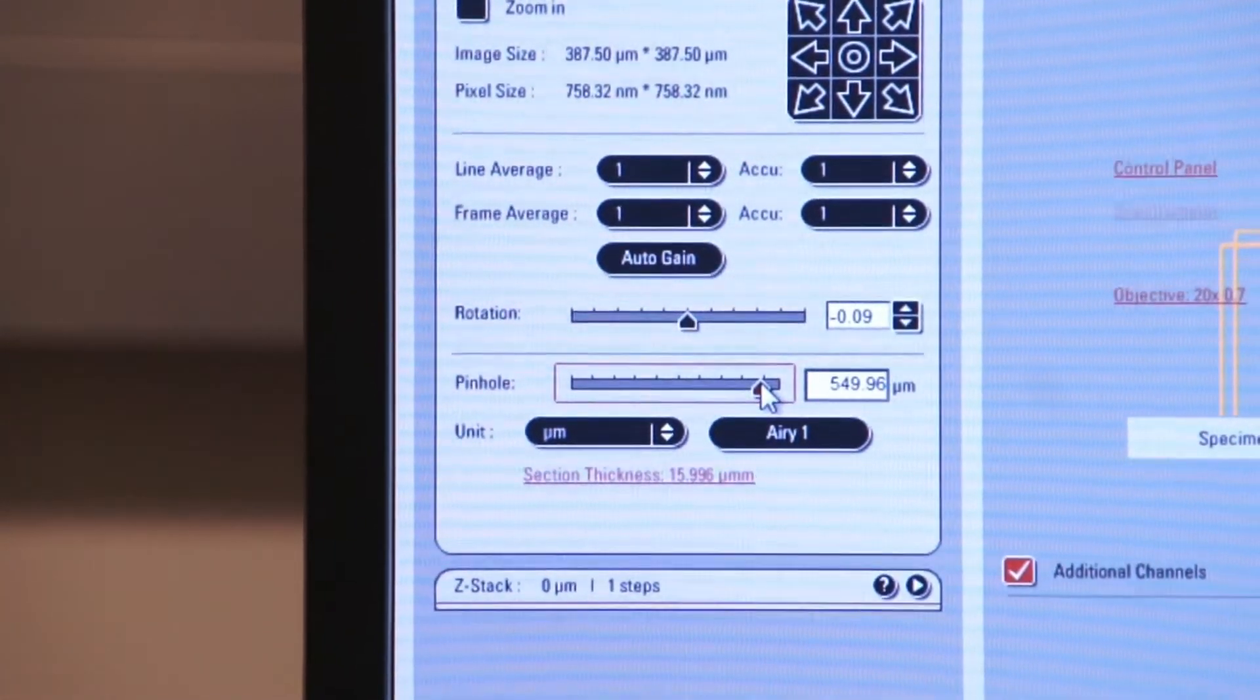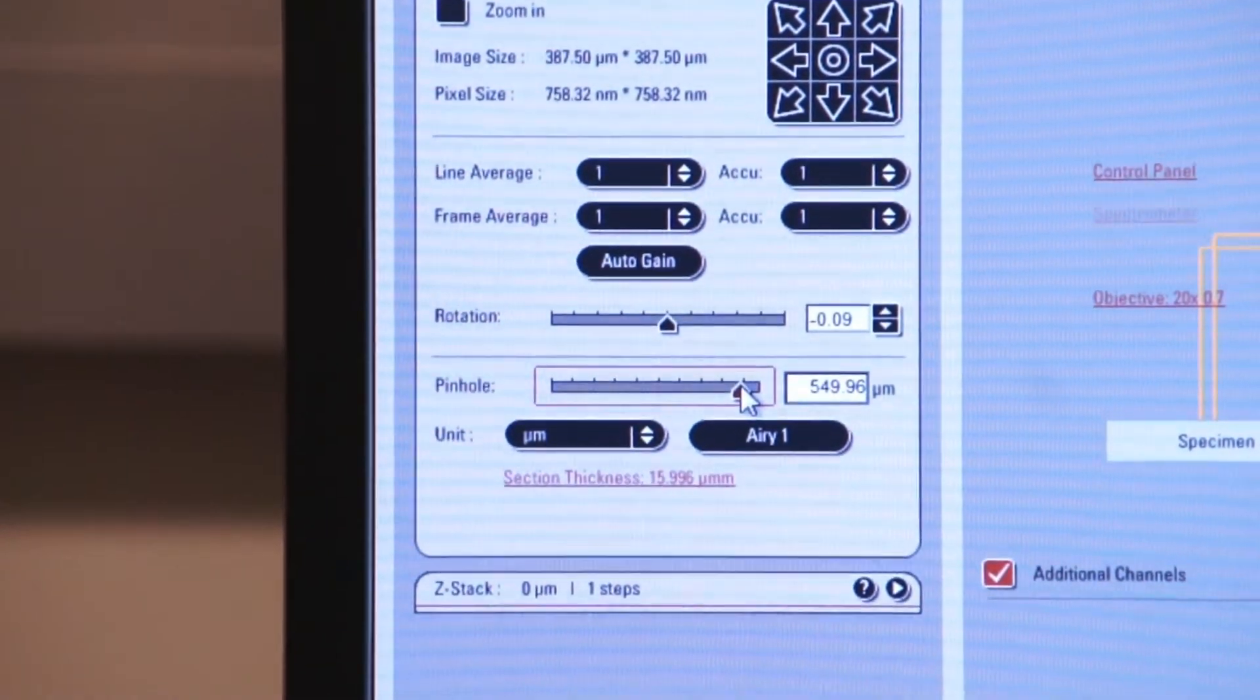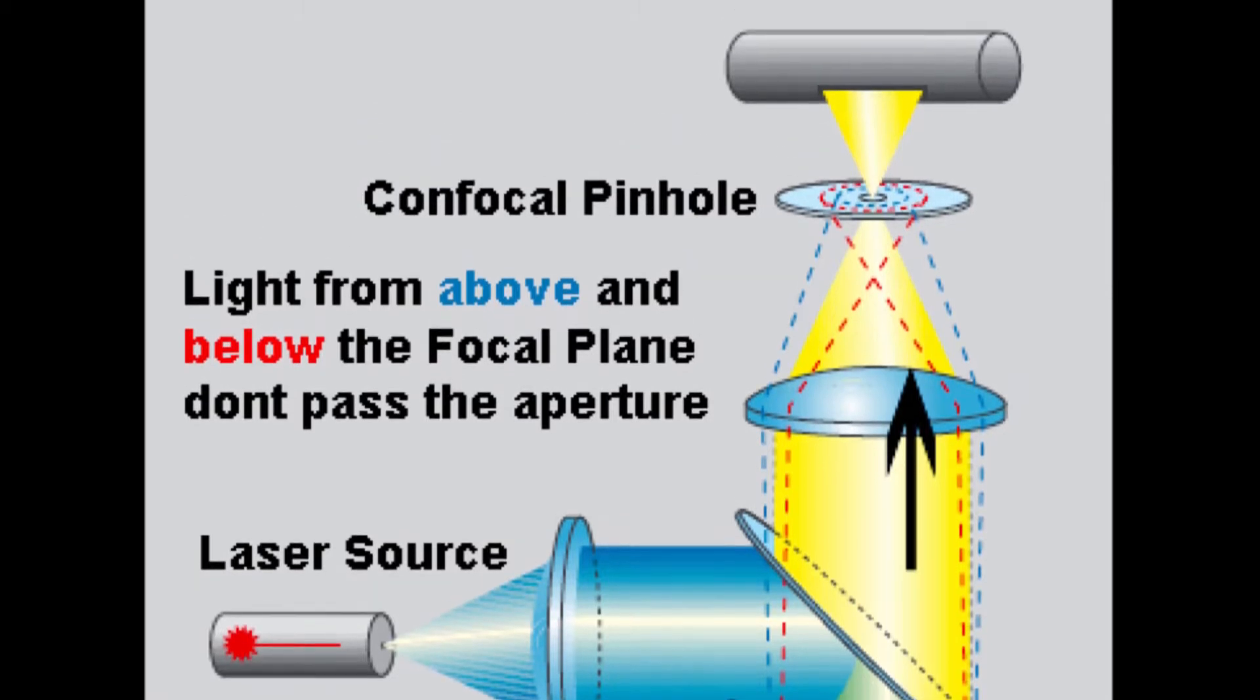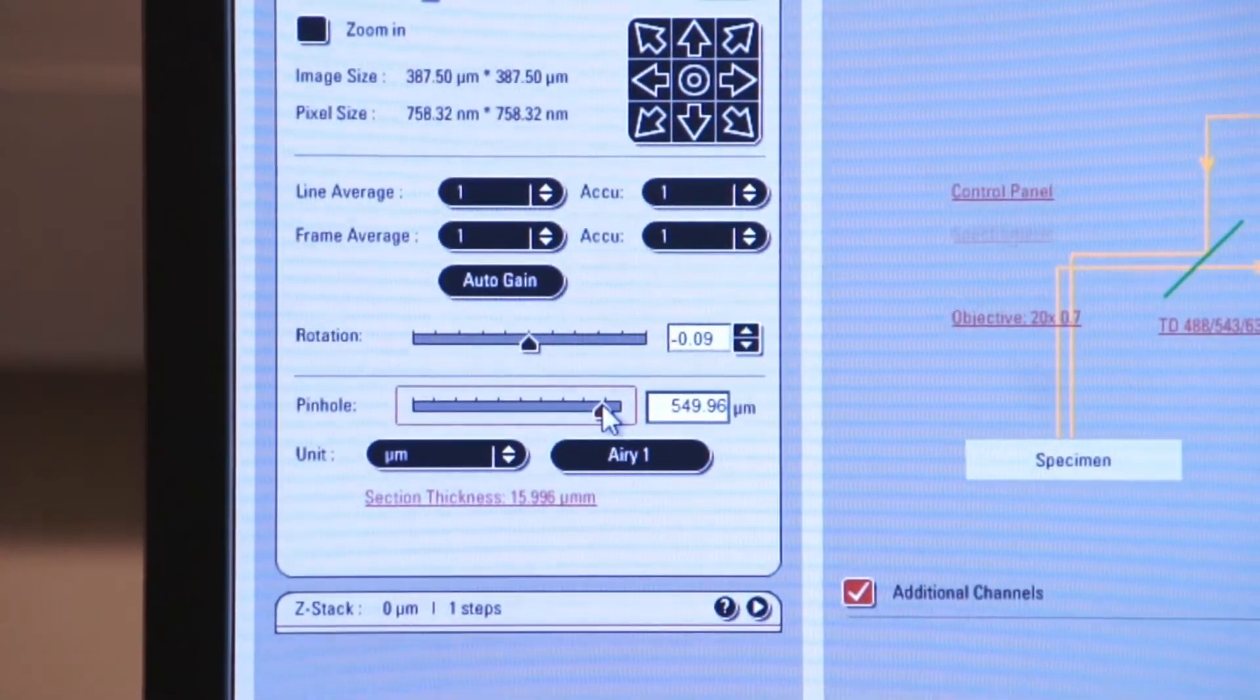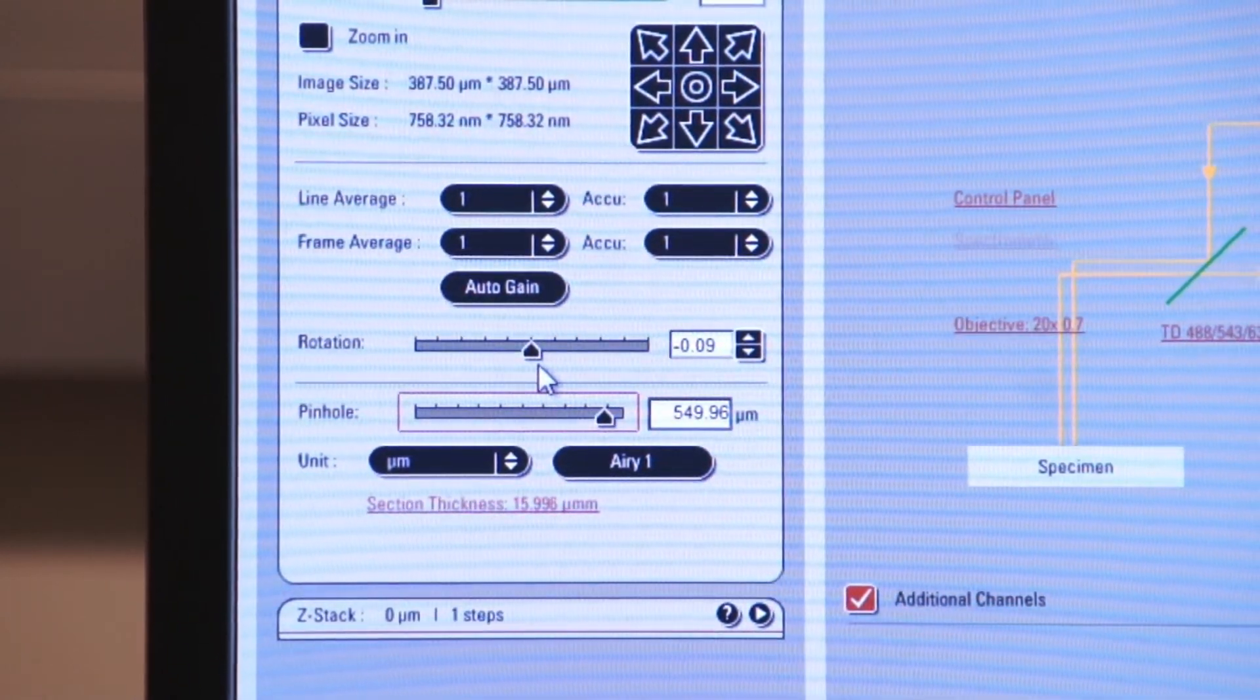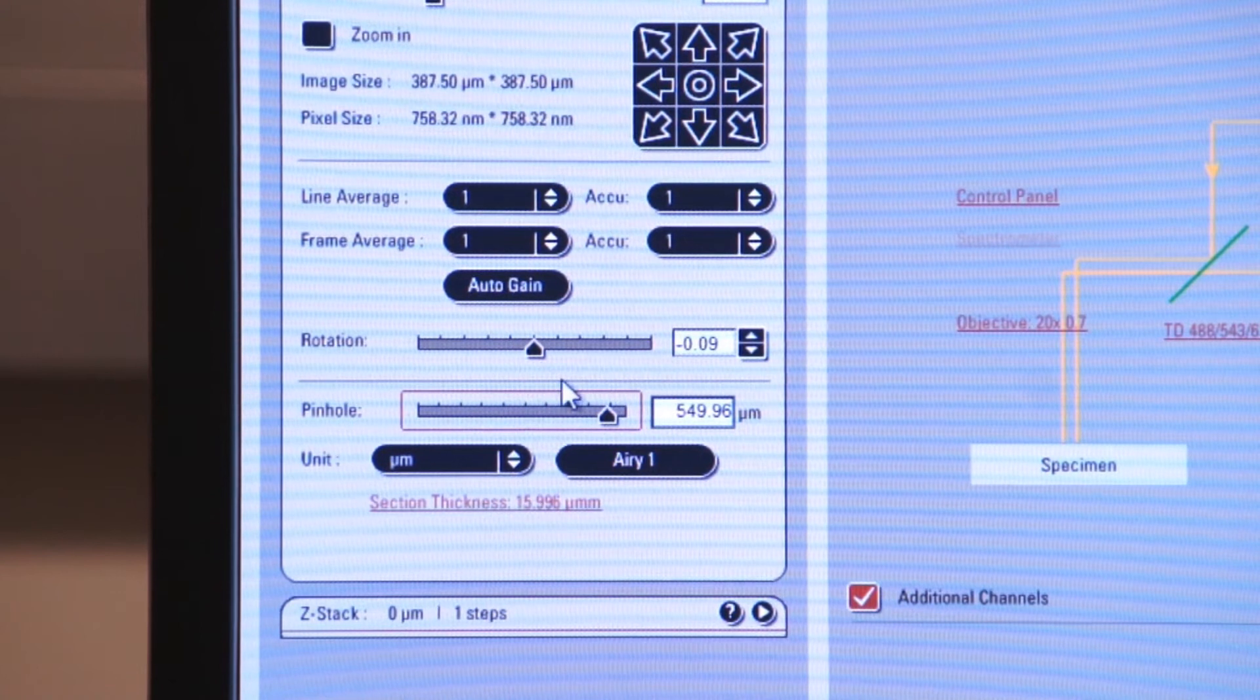The whole point of the pinhole, and there's actually two pinholes, one that you can manipulate right after the illuminator and another one that's inside the microscope which you cannot manipulate, is to give you the sharpest, high-resolution image as possible.